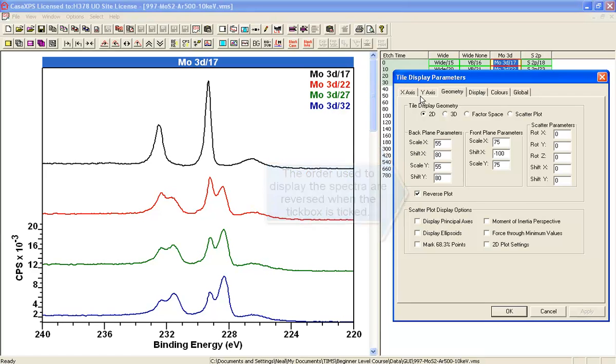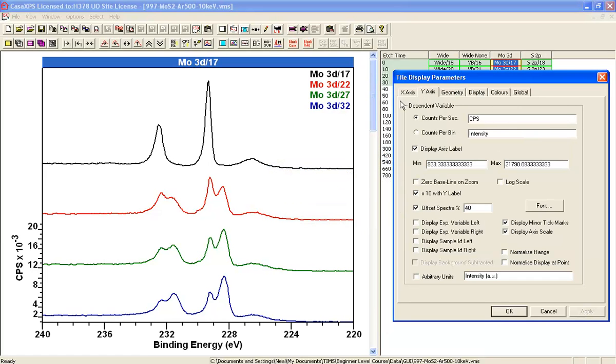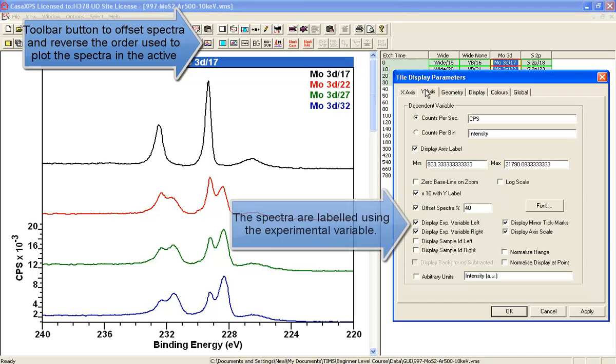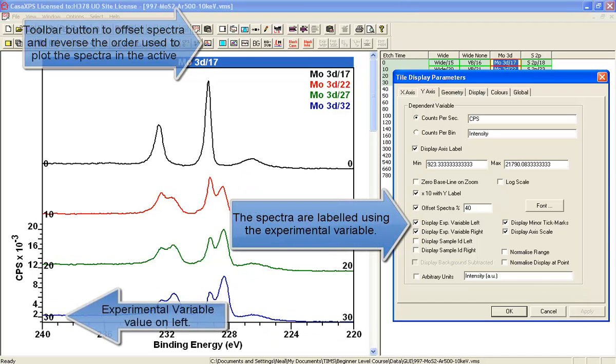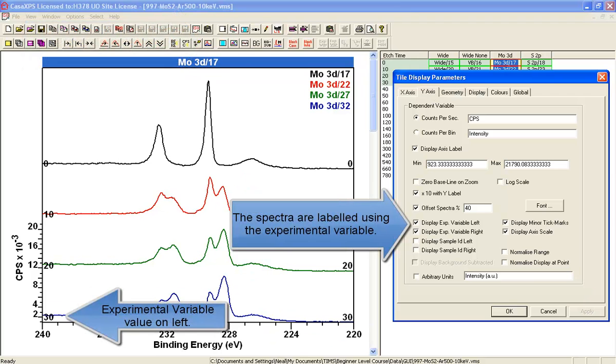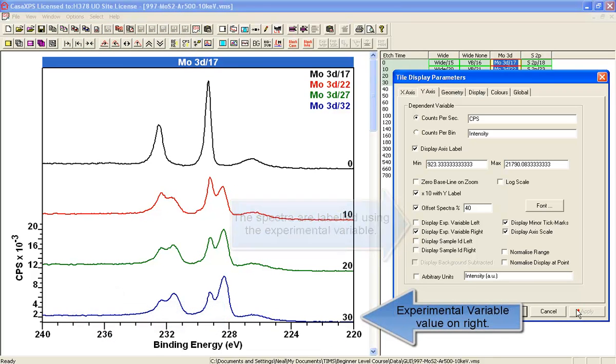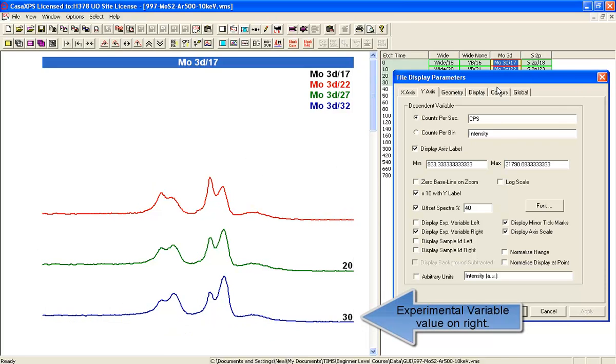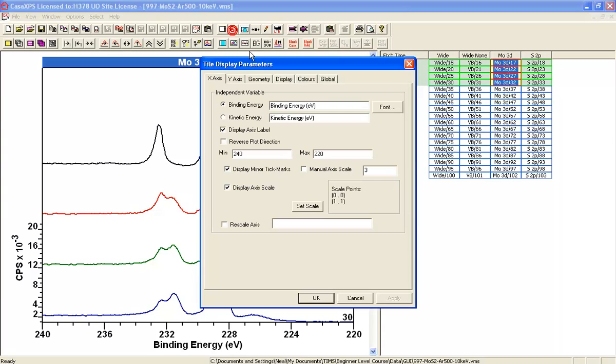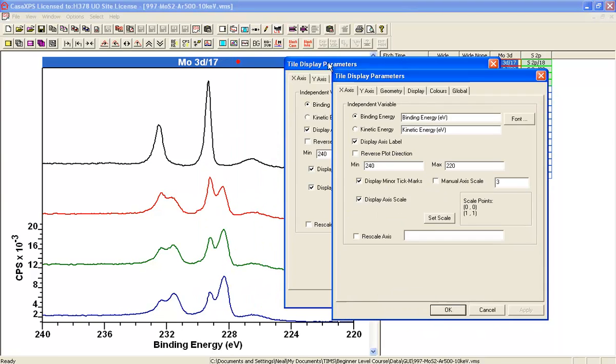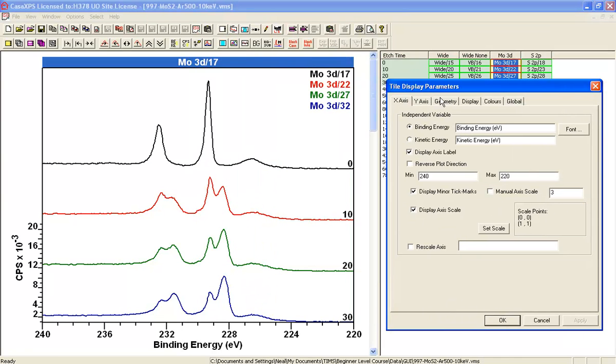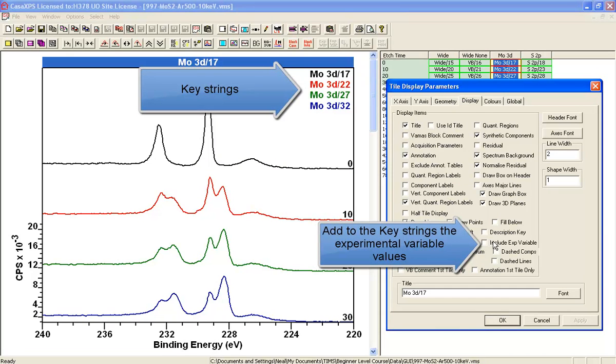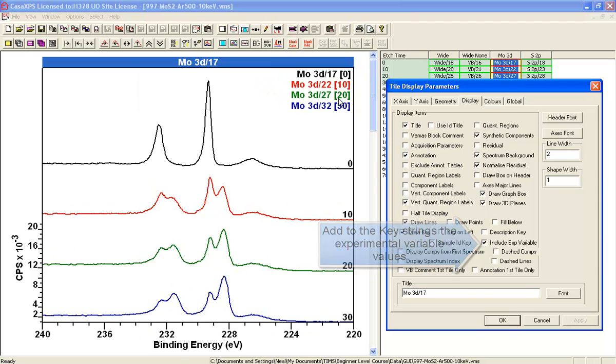We can see the experimental variable associated with these spectra by ticking these boxes here on the y-axis property page, and we'll just display one of them on the right hand side. These correspond to the experimental variable of h-time. One further way of seeing that is to add to the key the experimental variable, so now you can see the experimental variables here and it's also plotted next to the spectra. Thank you.